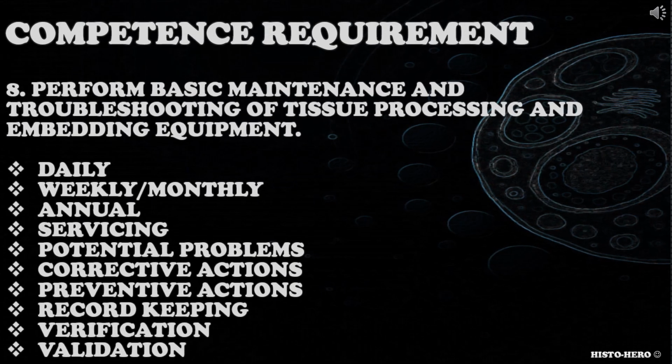The eighth competence requirement is perform basic maintenance and troubleshooting of tissue processing and embedding equipment. Candidate should be able to perform maintenance and troubleshoot issues with tissue processing and embedding equipment. Does the candidate know how to deal with processing and embedding equipment during maintenance? Do they know how to perform the maintenance? Do they know how to troubleshoot processing and embedding equipment? Do they know how to record troubleshooting and maintenance of processing and embedding equipment? Can they verify if the equipment is fit for use following service or repair?